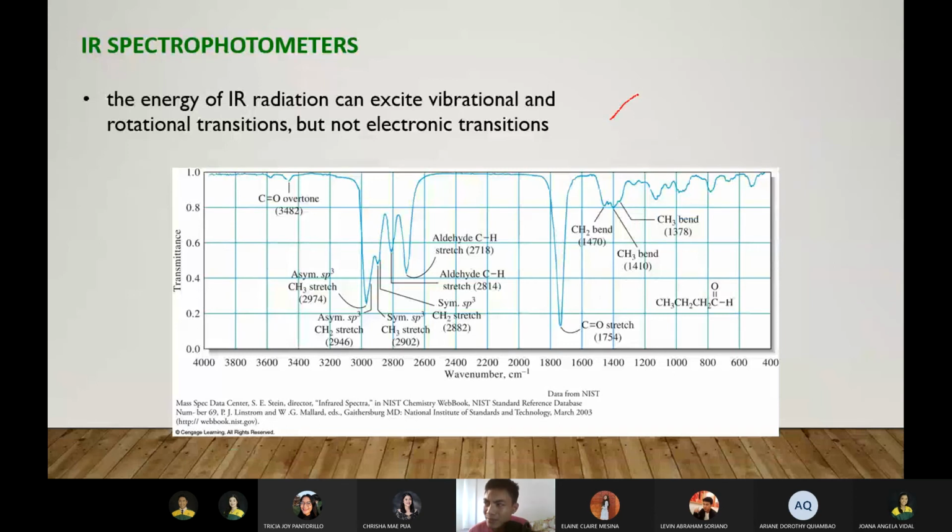So for example, you have this sample. You have this compound. Hindi ko yung papangalanan kasi di ko alam pangalan. Nanghula lang ako ng compound. Kunwari, you have this sample. Gagawin mo, papatama mo yun ng infrared rays. No? Ano ba nangyayari when infrared rays hit the molecules? Ganito. Nagva-vibrate yan. So, nagva-vibrate yung bonds.